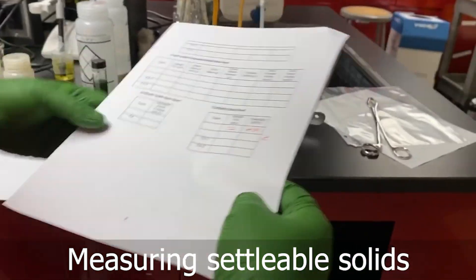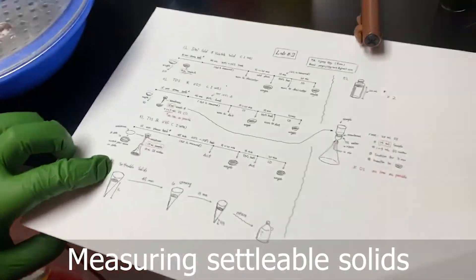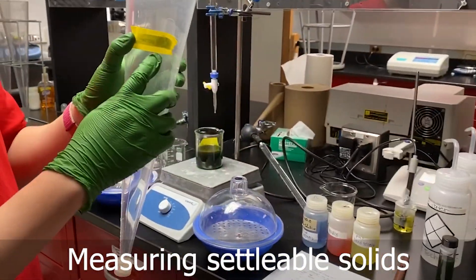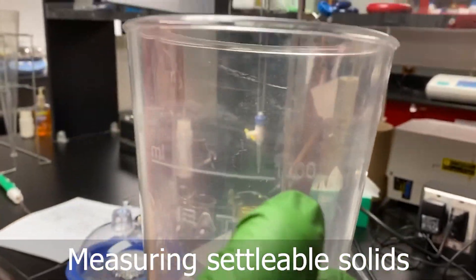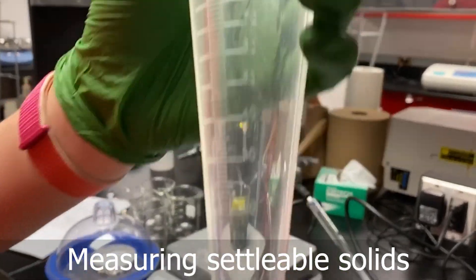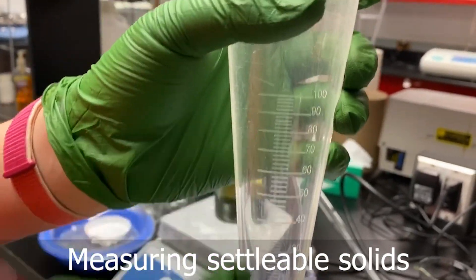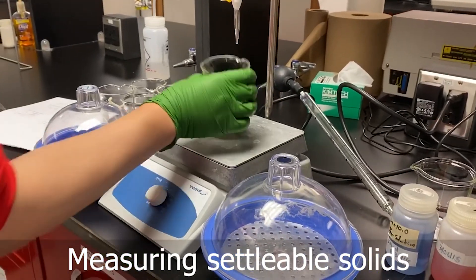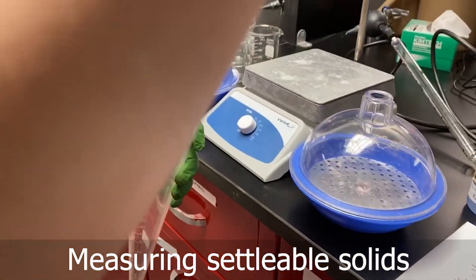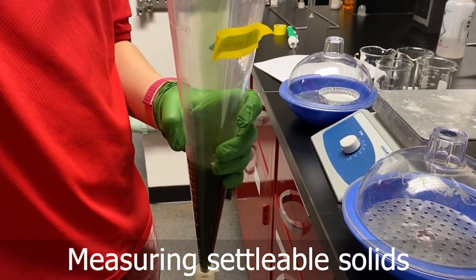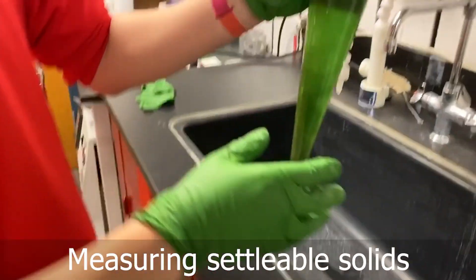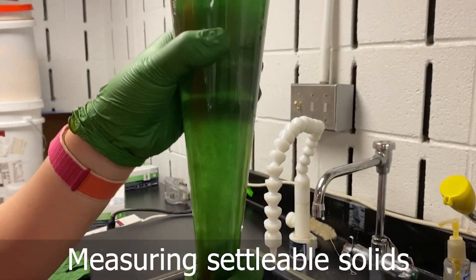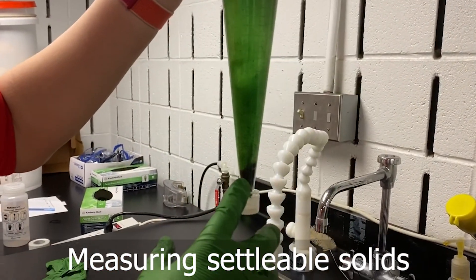And finally, we are going to do the settleable solids. We use this cone and you can write your name down, and then we can see here is the scale of 1 liter. Because I don't have 1 liter wastewater sample today, I just use all of this. Now we have 1 liter of the wastewater sample, so we can just wait when it's settling down.